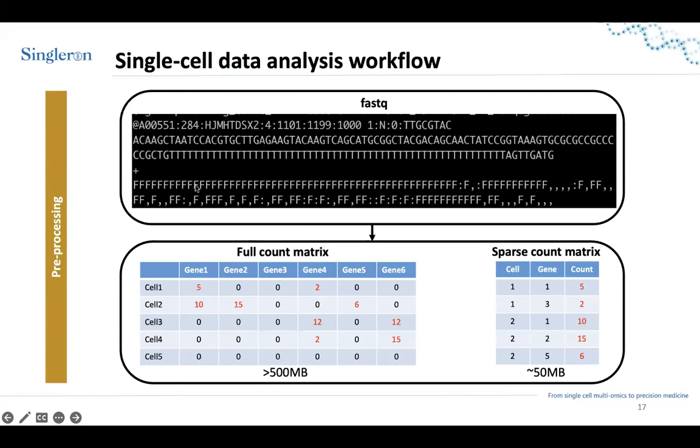And then you have a quality score here, shown with some characters, F or comma, etc. So basically, this is one line, starting with the header. And the sequence with A, C, A, etc., wrapped to the next line, is the second line. Then you have the plus, and then you have the fourth line that is again wrapped. The number of characters that you have in the fourth line and the number of characters that you have in the second line are equal.